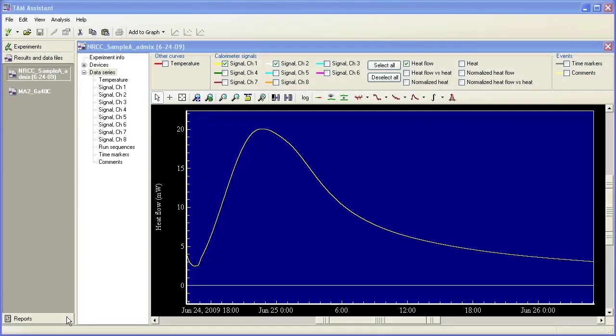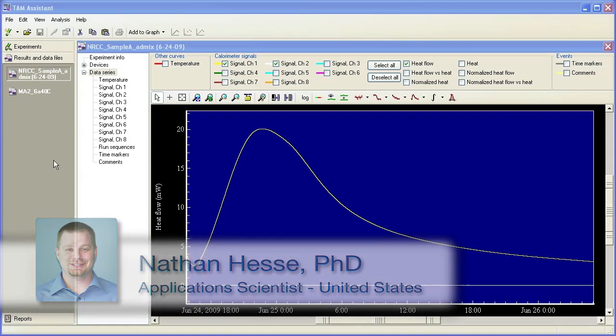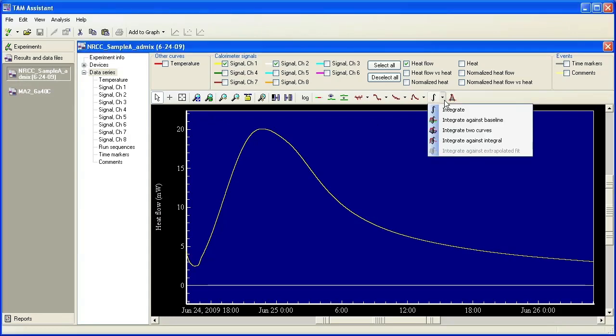In this TA Tech Tip, I'll show you how to integrate from the TAM Assistant software. You have the two files open here and you can come over here to the toolbar and choose integrate.